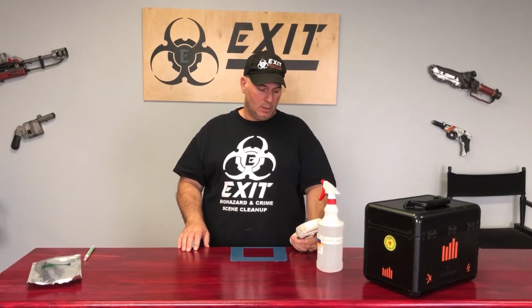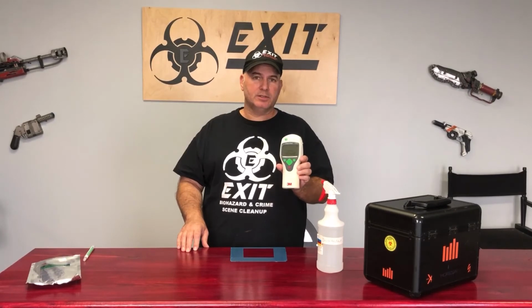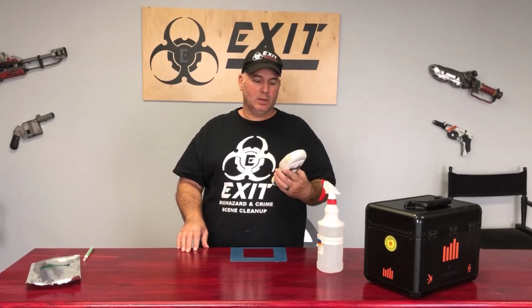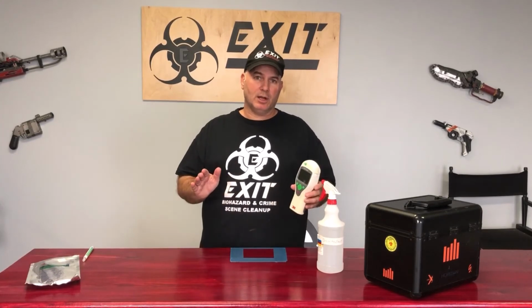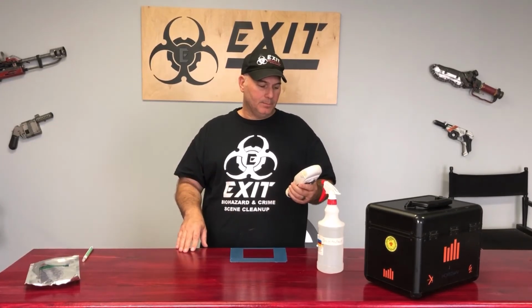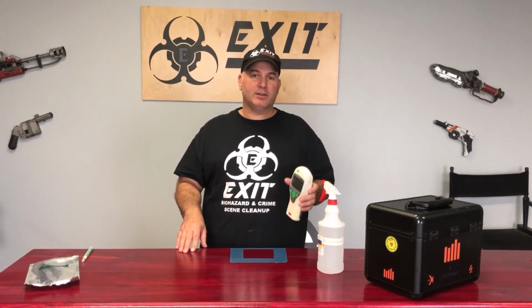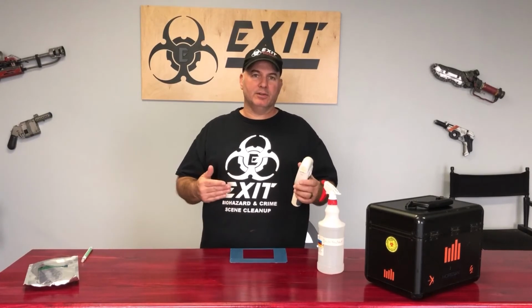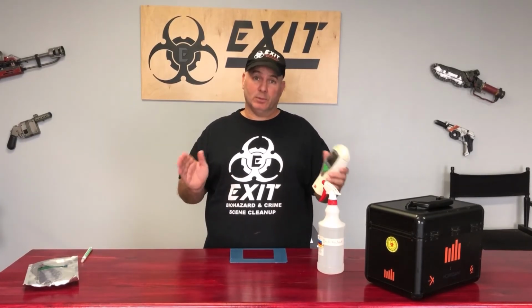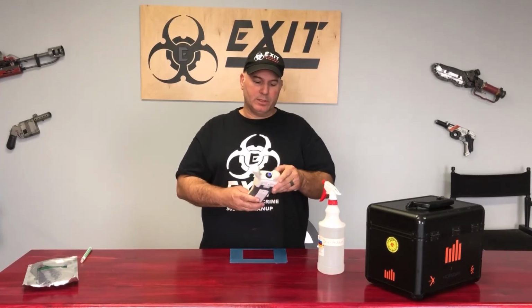Okay. We went from, what was it, 1,250 to 16 RLUs. Okay, so that shows me that our disinfectant is doing its job. That's quite a bit. That's pretty low, actually. So that shows me that this is clean, at least by the standards that we set out. Anything under 250 was going to be considered clean. Okay, so we're doing pretty good there.